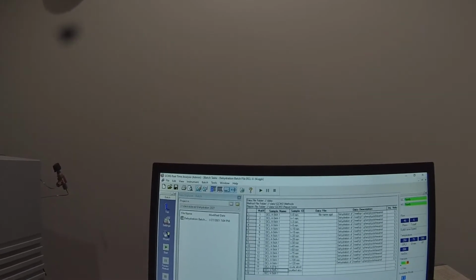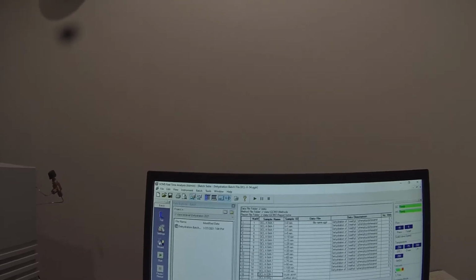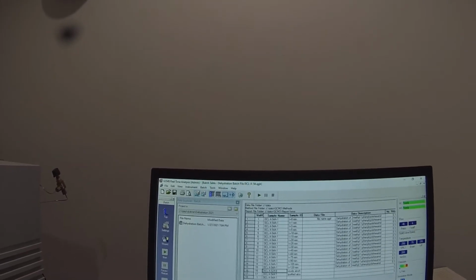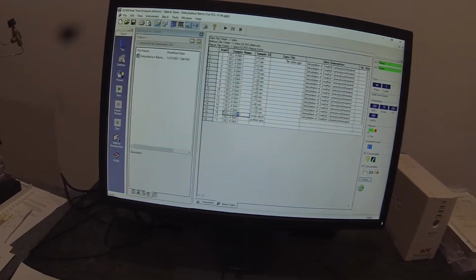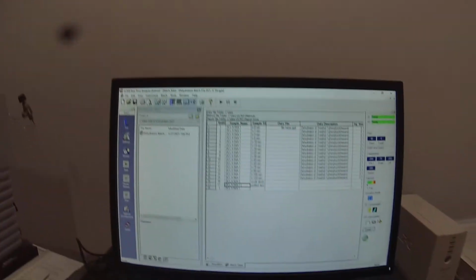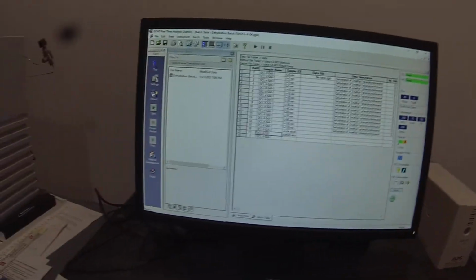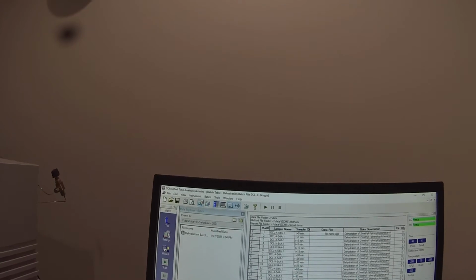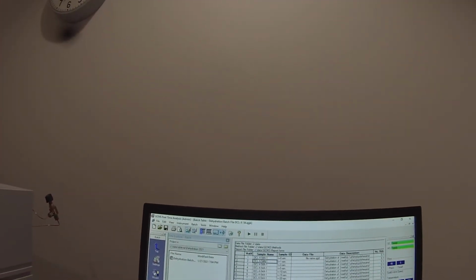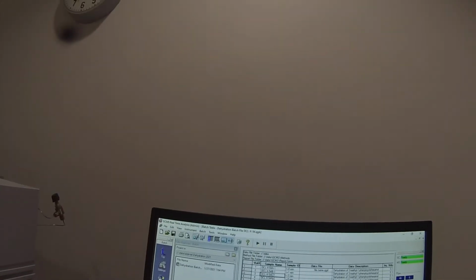But of course down here this isn't 54A, this is 52A. And it's actually 52A-3. I can find the dash. Because dash 1 and dash 2 were the IR. And this is 52B rather. And it's the first spectrum on that, so 52B-1. And then I just need to go in here and change the A to B, C, D, etc.